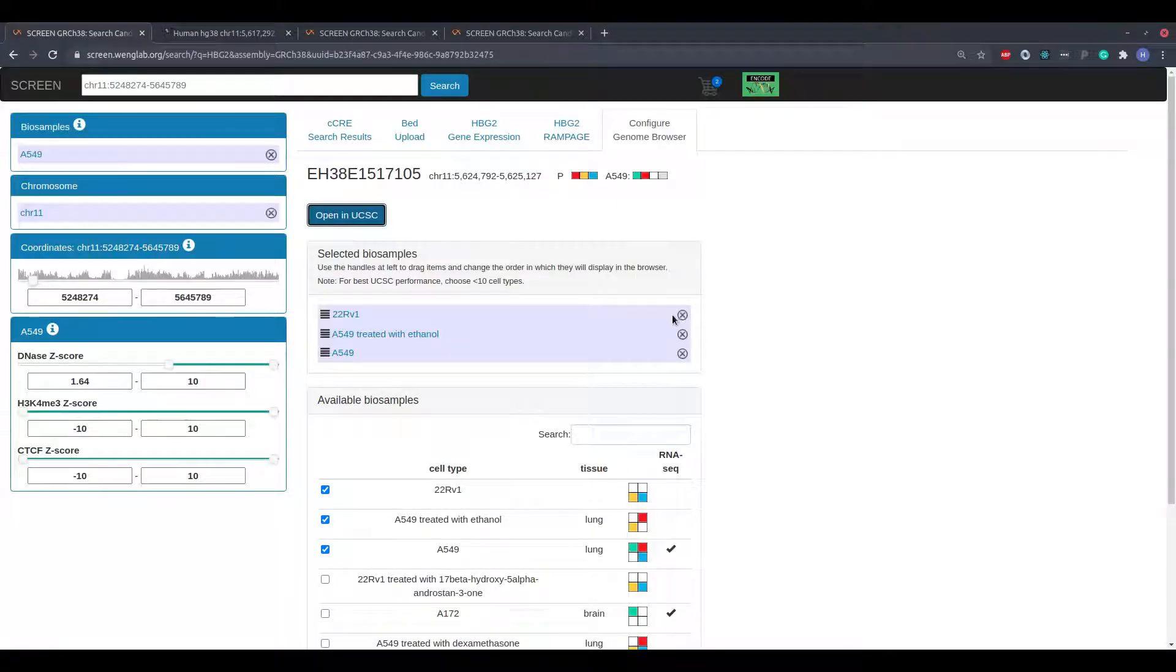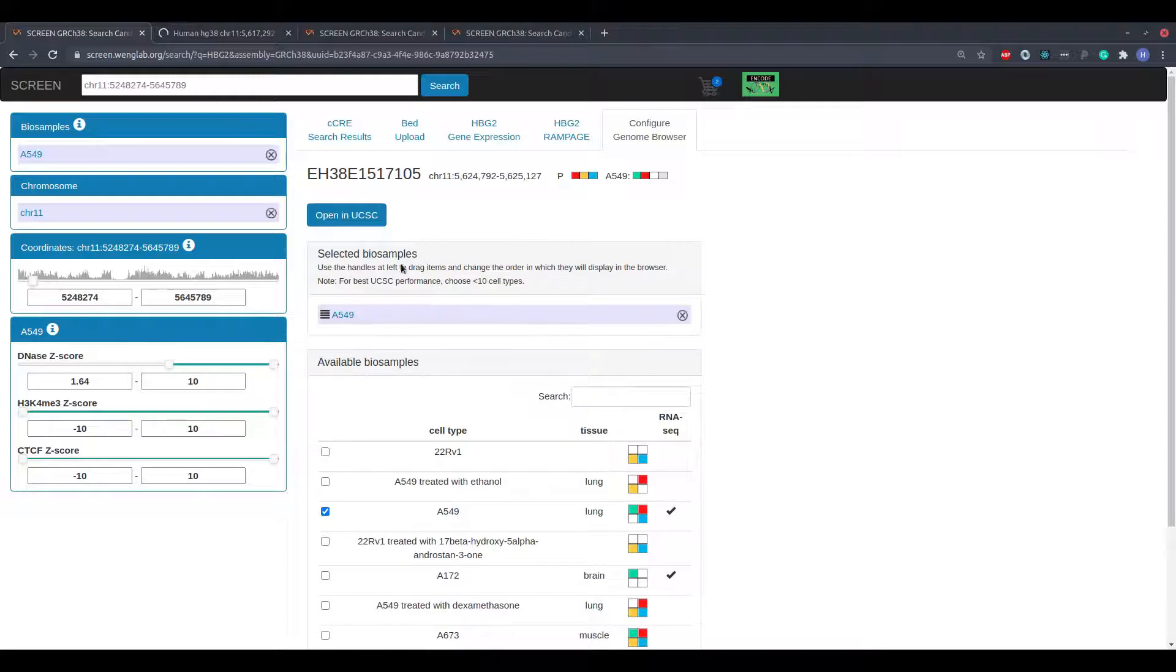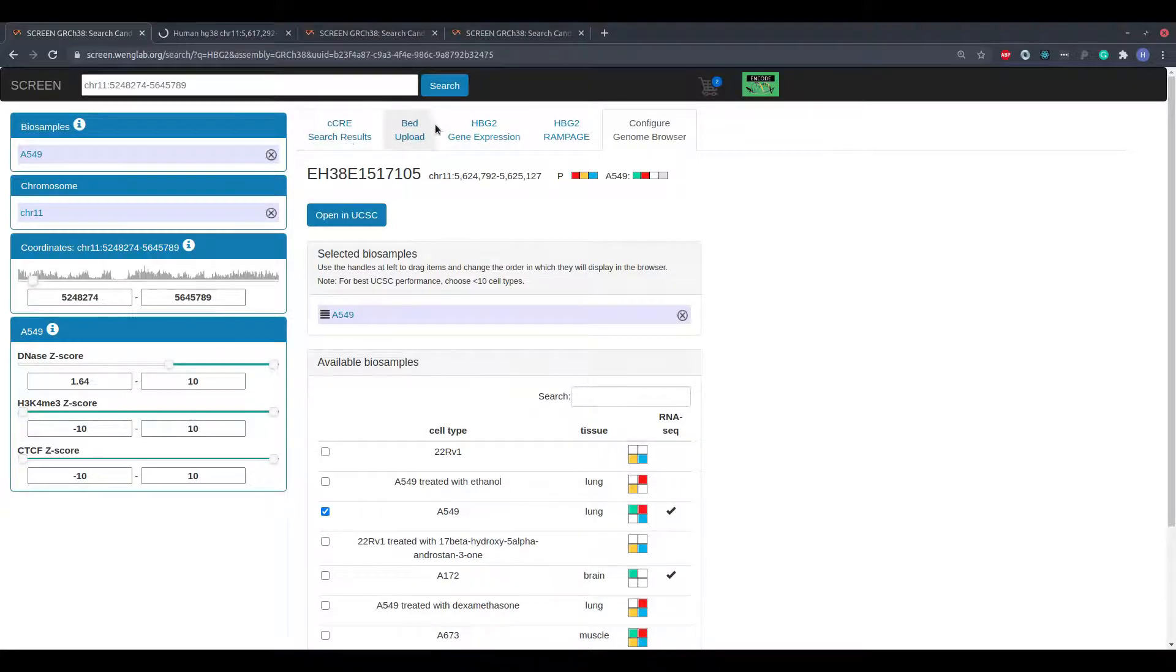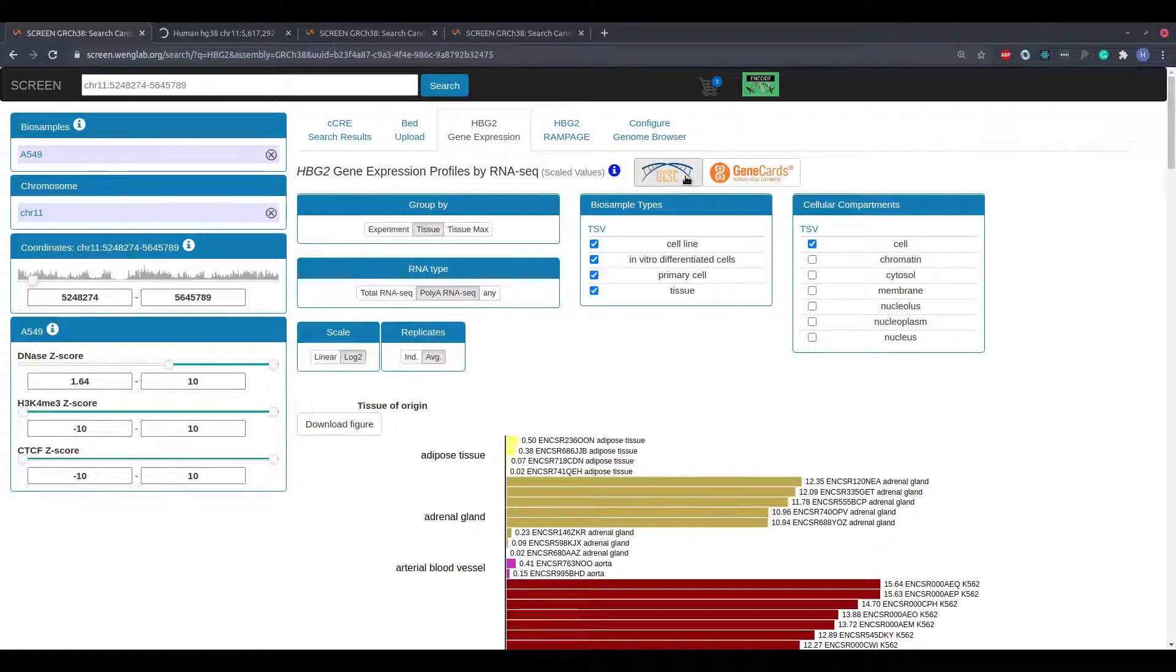I can remove the selected BioSample by clicking the X to the right of its name in the list. UCSC buttons are also available for various other genomic features around the screen.